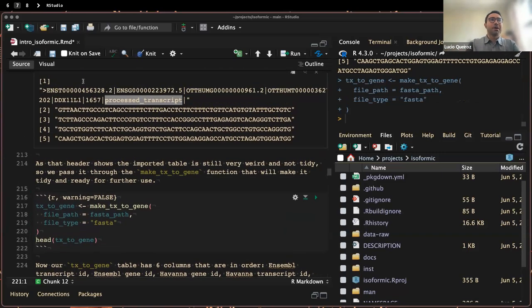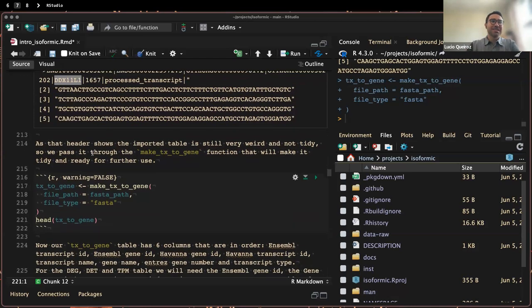It's an important moment to talk about this. You're going to see that we try to use the actual transcript ID instead of the transcript name or the gene name over the analysis, because sometimes you find different gene codes annotated to the same gene, or genes that don't have an official name yet. So usually if you convert directly to the gene name or the transcript name, the HUGO names, before doing the analysis, you are biased, and in the end you don't really know which genomic region, which genomic locus you're talking about. It's a pretty common mistake.